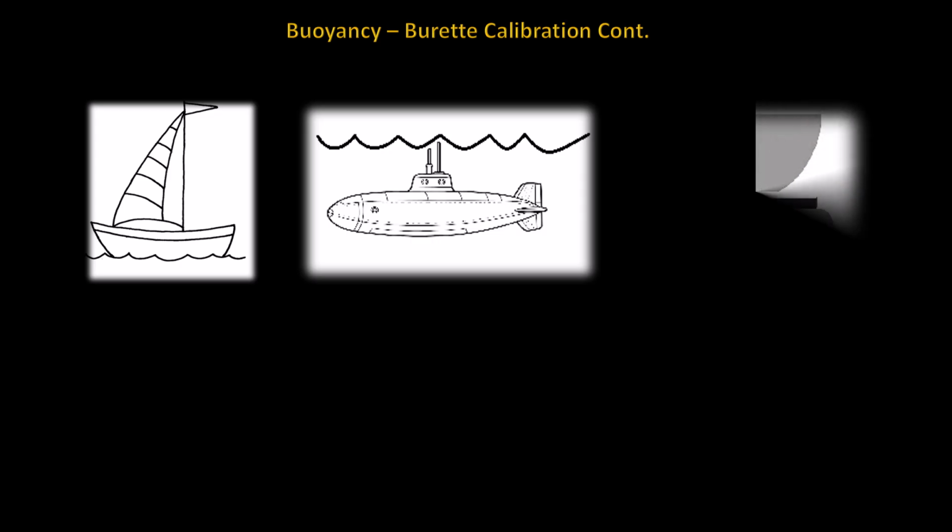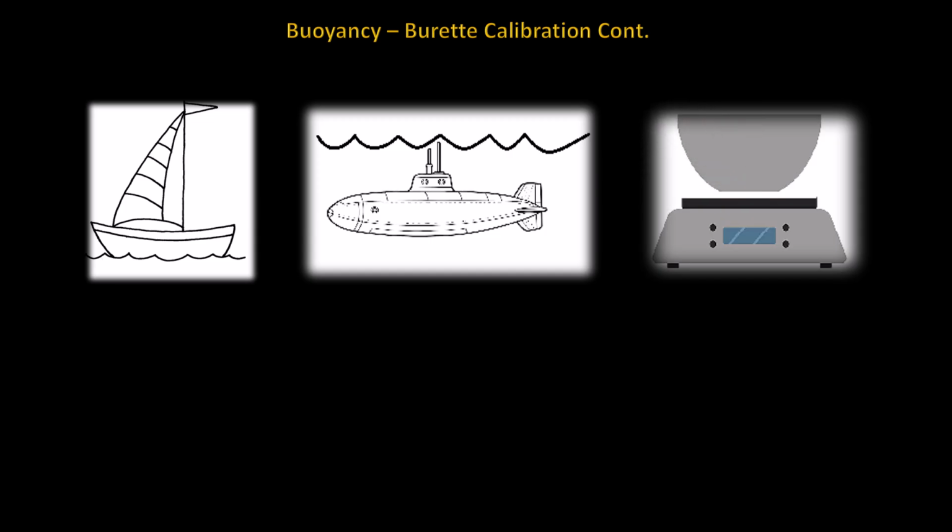Now, air is similar to water. It surrounds everything. As a beaker or other container is placed on top of a laboratory scale, the air on top of the pan is displaced. There will always be some atmosphere, albeit microscopically thin, that still adds weight. That is added to the weight of the object that is placed upon the pan. In essence, the container actually floats on top of that extremely thin volume of air, similar to the submarine. That weight must be accounted for. The equation shown accounts for the amount of air that is being weighed in conjunction with the mass applied, which would be the beaker or other container.